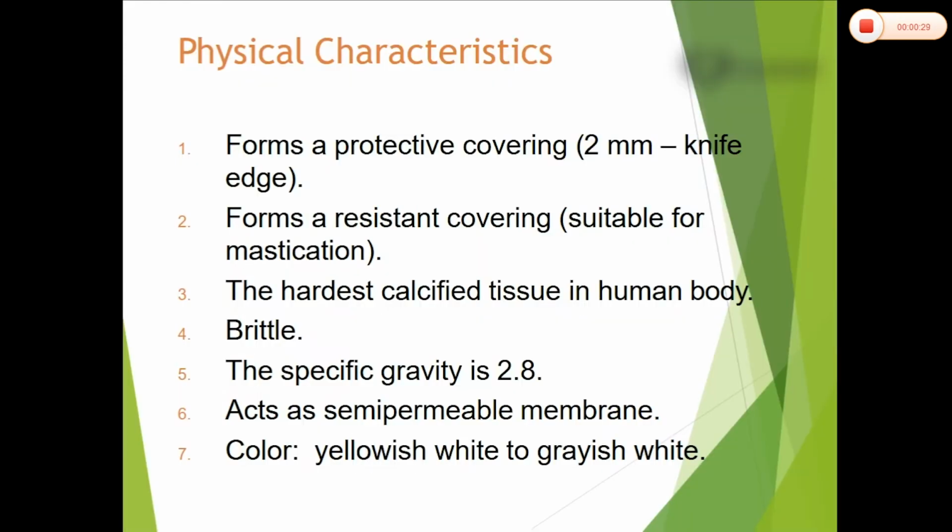The title of our lab today is Enamel. This is the practical session of Enamel. Here in the enamel lab, you can distinguish between the enamel structures and enamel surfaces.